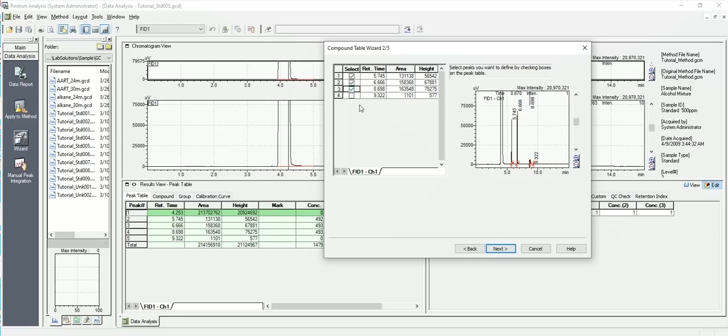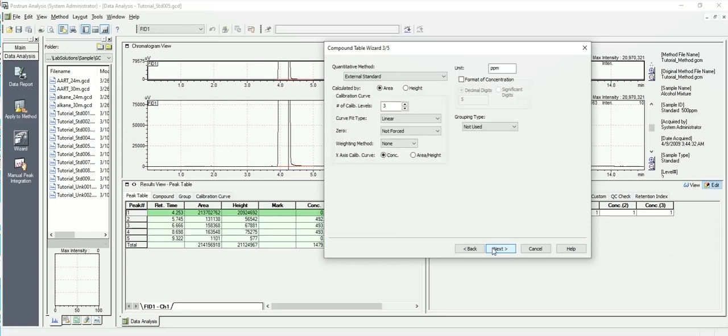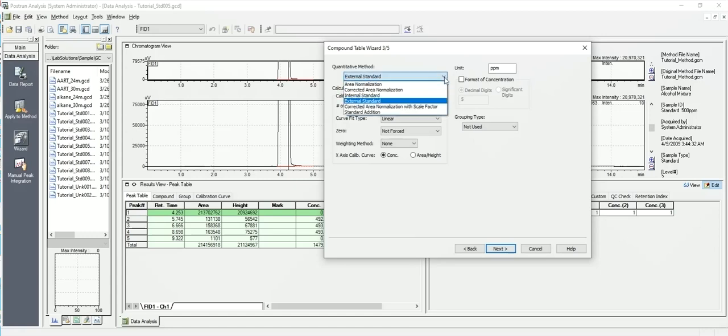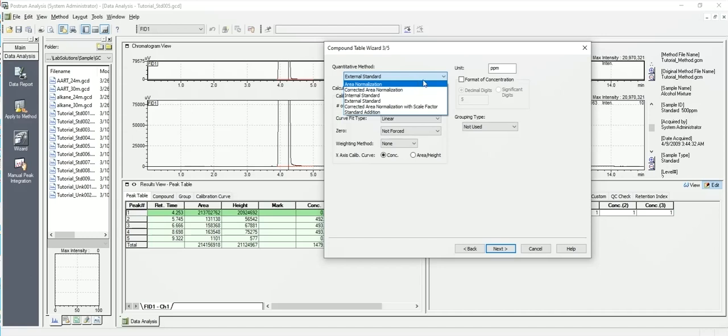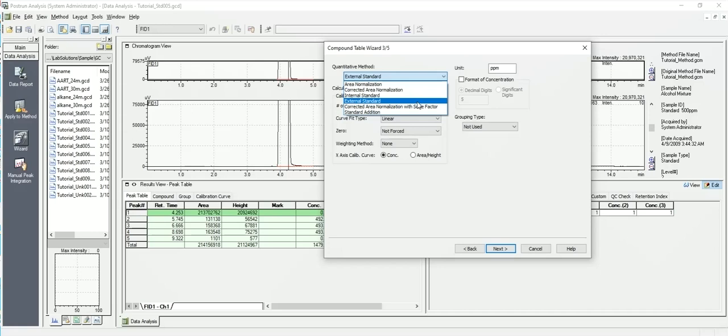And I say next. What method of quantitation will we be utilizing? In this case here we'll say external standard, but you could also do internal standard or any of the other methods. Area normalization, where everything adds up to 100 based on area, but the big one is external standard or internal standard. Okay, so let's go with external standard first.